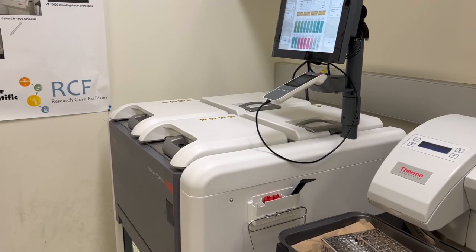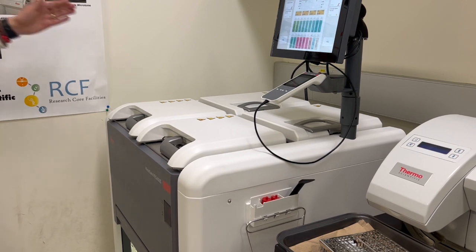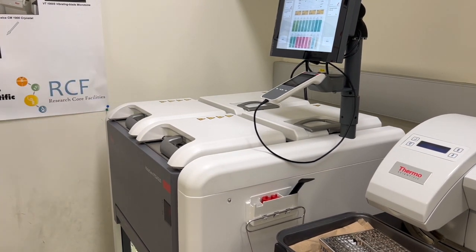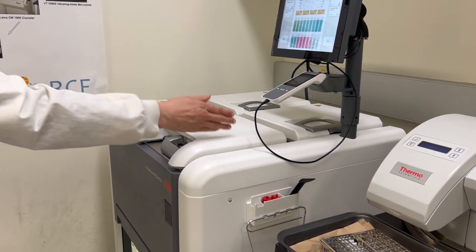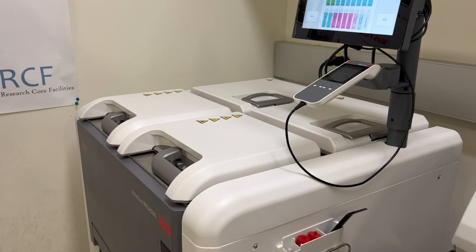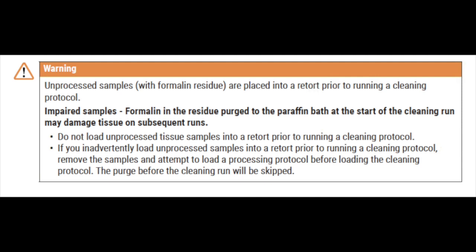There are two retorts, retort A and retort B. Ensure you select the retort you booked to use. For example, we selected retort A. It should show that retort A is either clean or has a residue of a reagent compatible with the first reagent of the protocol. If the first step of the protocol uses a reagent that is incompatible with retort residue, a warning message will be displayed. You may need to run a cleaning protocol or you may be able to skip the first steps of the protocol.